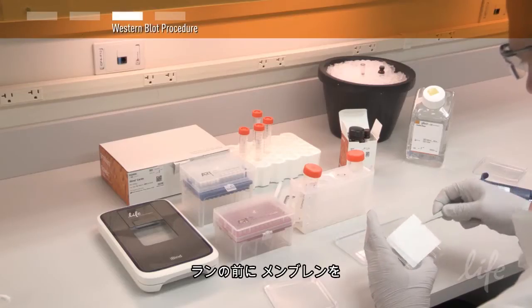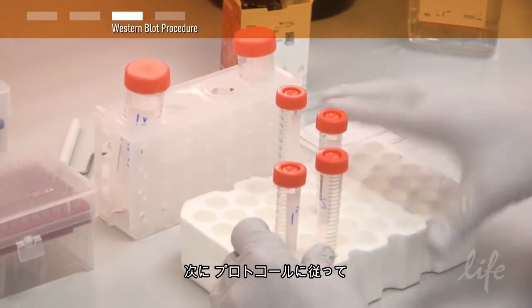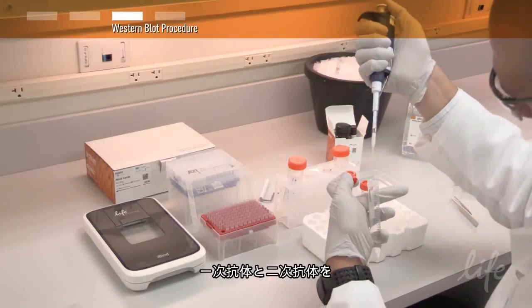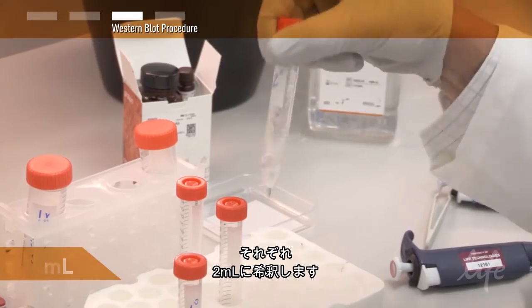To prepare the run, immerse your blotted membrane in 5 milliliters of the 1X iBind solution. Next, dilute your antibodies with the 1X iBind solution, according to the protocol recommendations, to a total volume of 2 milliliters for both the primary and secondary antibodies.